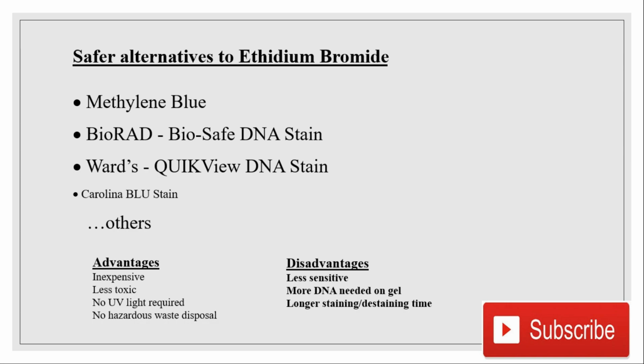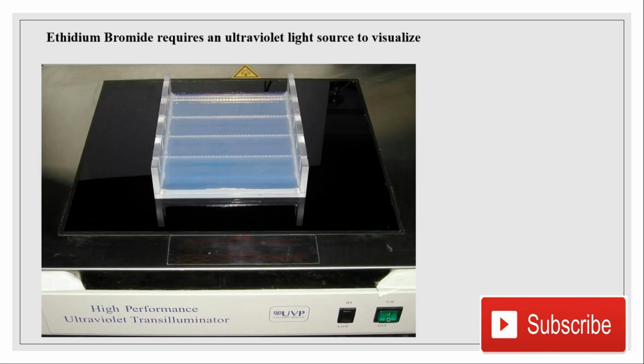So it depends upon the other replaceable staining material that you are using. So try to find another source rather than ethidium bromide. But if you don't have any other source, you can use the ethidium bromide, but precautionary measures should be adopted while using the ethidium bromide.